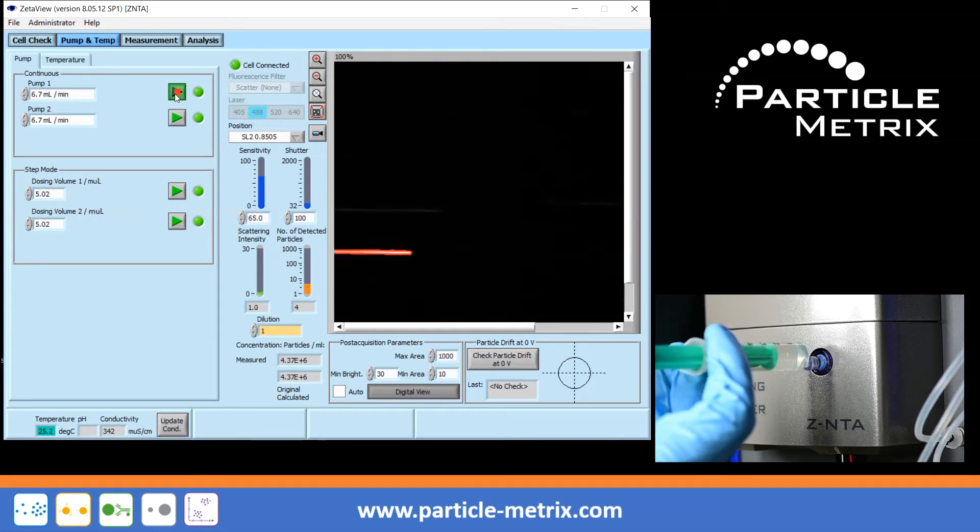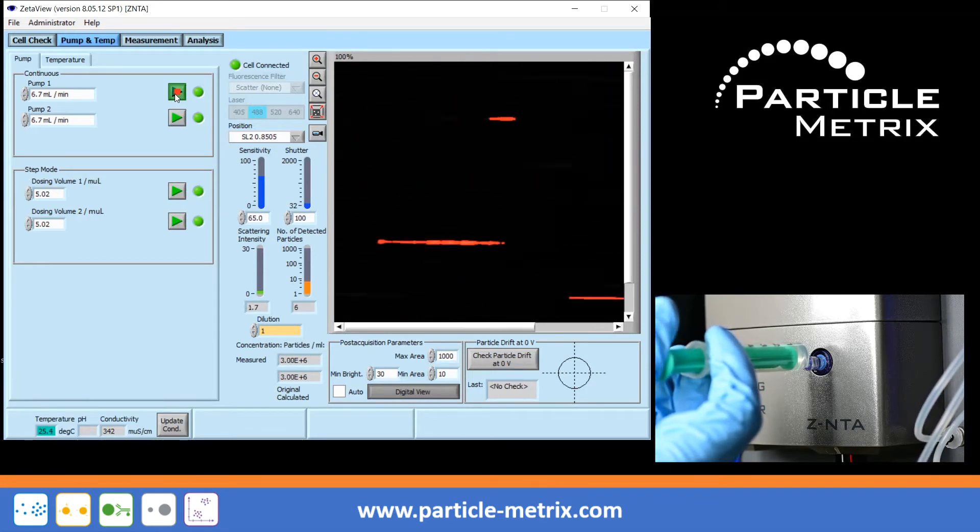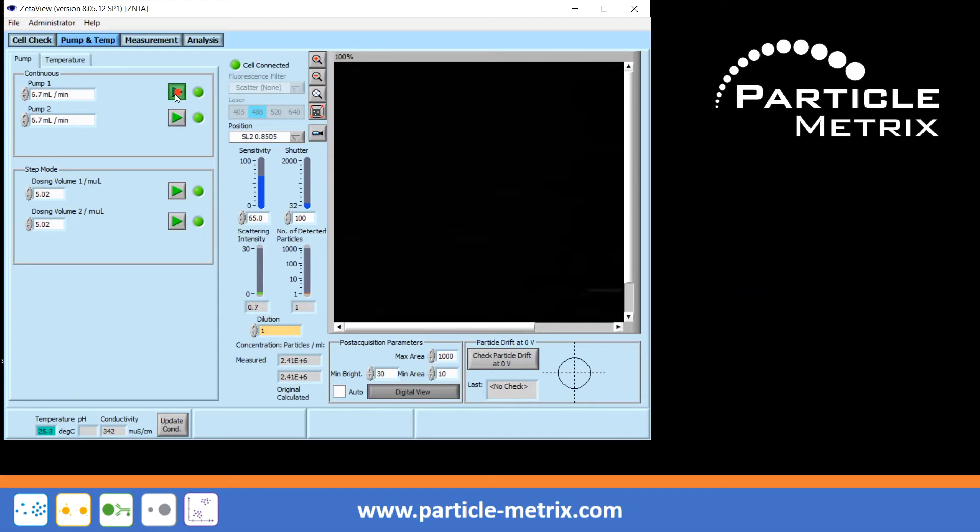By pumping and simultaneously injecting liquid from the front, the dead volume between the injection valve and the measuring cell in the cell assembly is also filled with liquid.